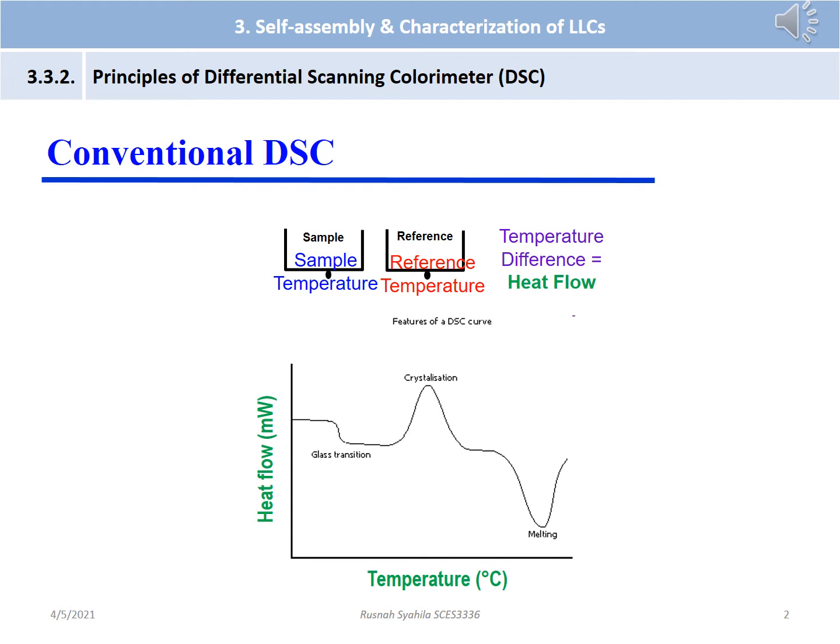DSC is more accurate to assign the transition temperature and to confirm the phase change, but gives no information on type of phases. Except, it is very useful to distinguish gel phases from crystals. The typical delta enthalpy for gel melting is almost half of that of crystal melting. Gel phase usually melts to lamellar but not always. Mesophase melting transition enthalpies are small, typically 10% of the delta enthalpy of crystal melting. Based on the enthalpy change value, there is no difference between lamellar, hexagonal, or cubic phases.